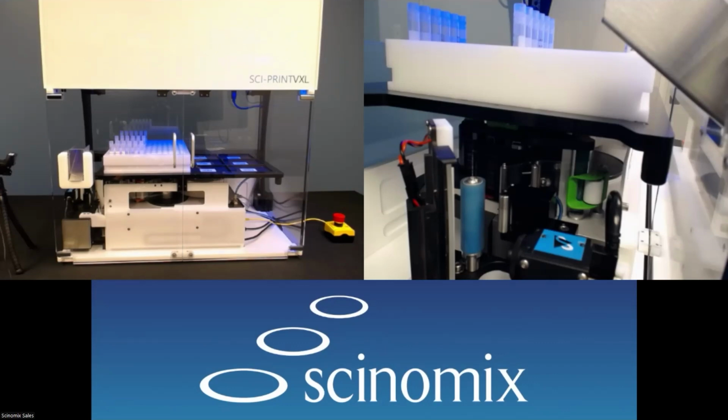So as Mark mentioned, if you're pre-scanning, you have existing labels that you want to overlabel a new label onto or take information from, or you want to do the alignment that he discussed. We're essentially scanning that initial tube, printing, and then we can also validate. So if you're used to our barcode scanners, we can also do the same side validation to assure that a label was applied and can be scanned further downstream.